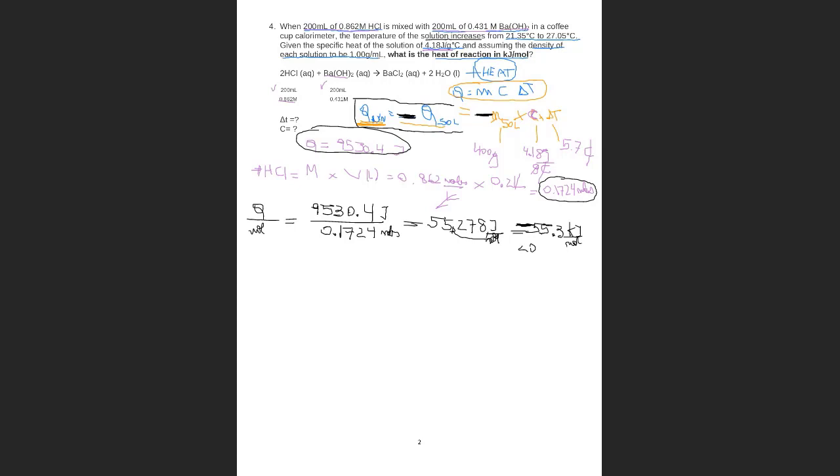You can think of solids, and so you can separate the solids that produce that heat and the water that absorbs that heat. Does it make more sense?